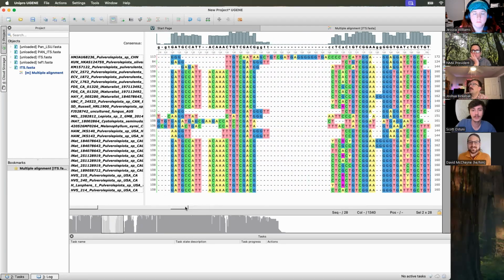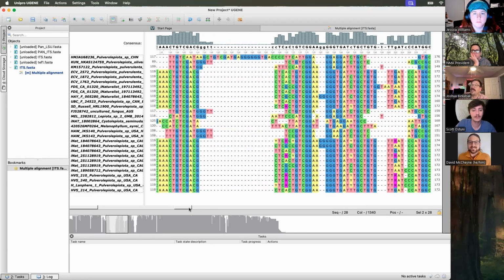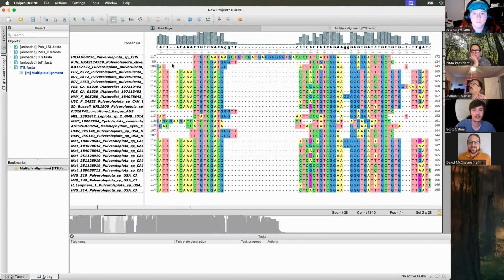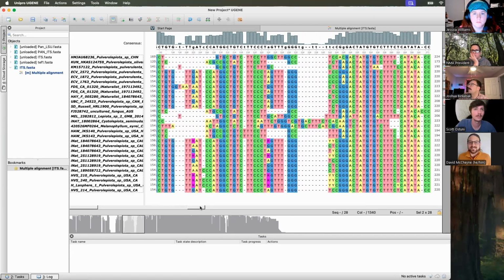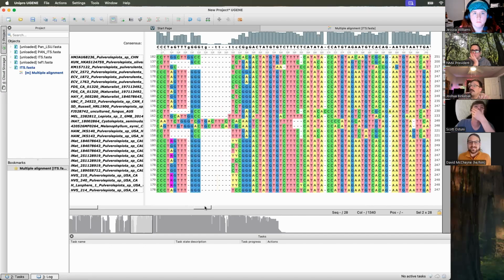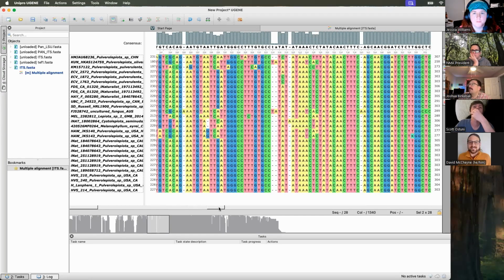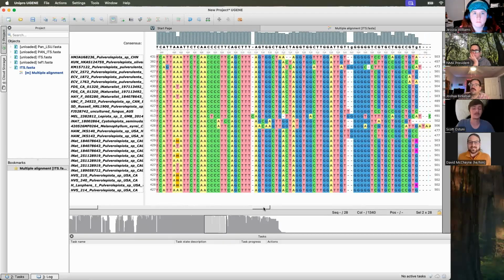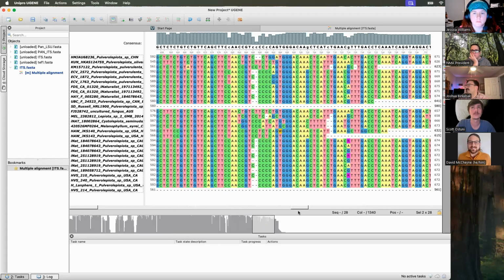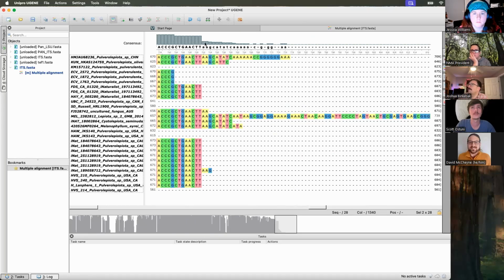Another thing I'm going to do here is not fuss over the alignment too much. Sometimes, in the same way, you'll see weird things. You could go, oh, what if I scooted this over? I could maybe eliminate some of these gaps. From a reproducibility standpoint, you might not want to do that. That way you could just say, hey, I did what the computer spat out and I ran it. Unless you're looking at it going, this is so ugly, I don't think there's real data here, just ignore little errors here and there.